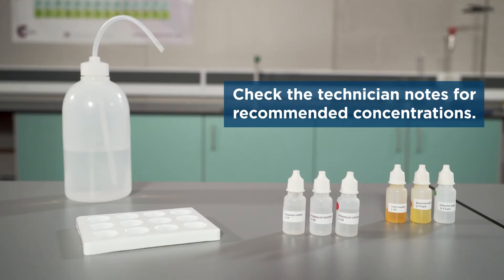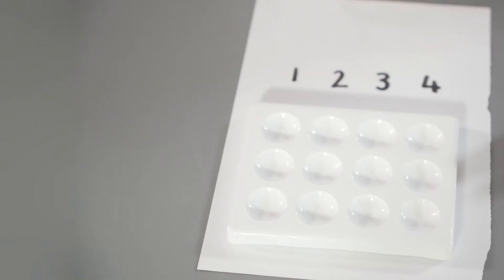We will carry out this experiment using a dimple tray. It is important that you label the rows and columns so you don't forget what you put in each dimple. You could use, for example, a piece of paper underneath your dimple tray or use a non-permanent marker to label the rows and columns: one, two, three and four.